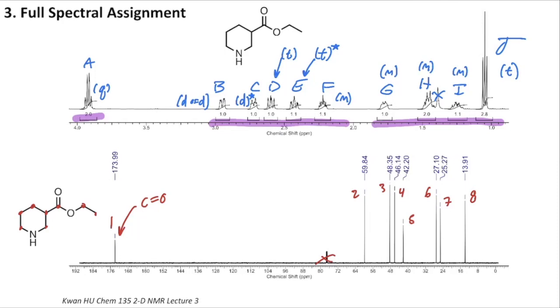So protons that are further downfield are going to be de-shielded, meaning that they have something electron withdrawing or very electronegative near them or next to them that is going to be pulling away some of their electron density. So it wouldn't hurt to start thinking about the things that are electronegative on our structure. First and foremost, one that is really screaming out to me is this ester oxygen. Of course, that's pretty electronegative, so that's going to be pulling in toward itself this way and this way.